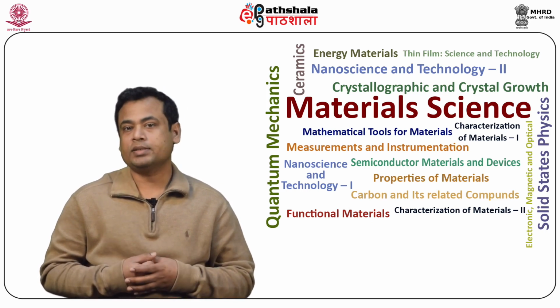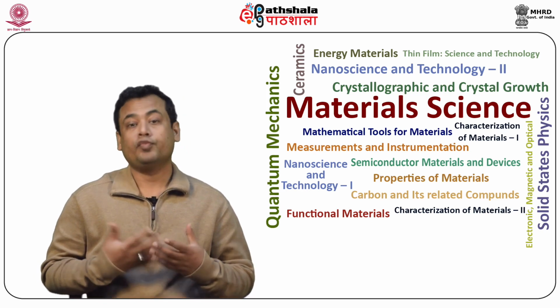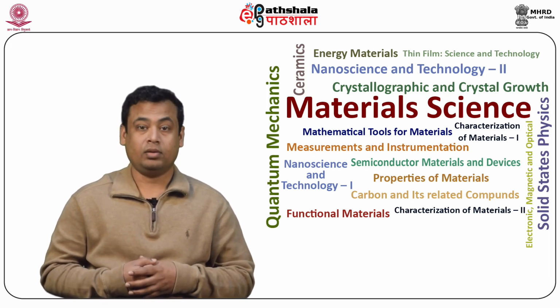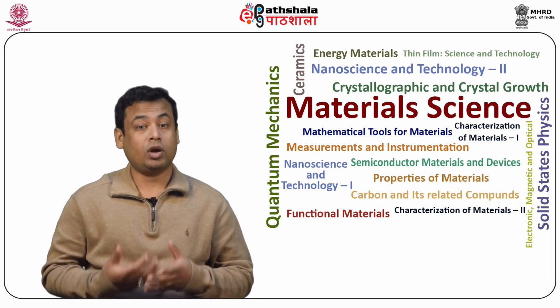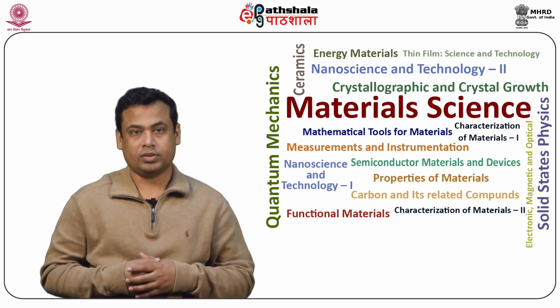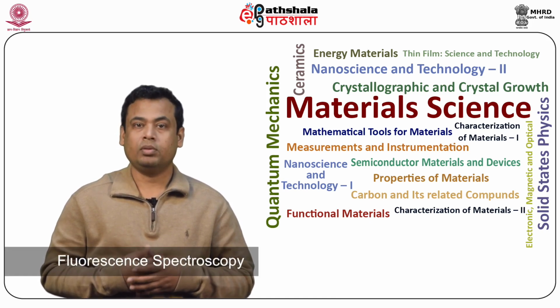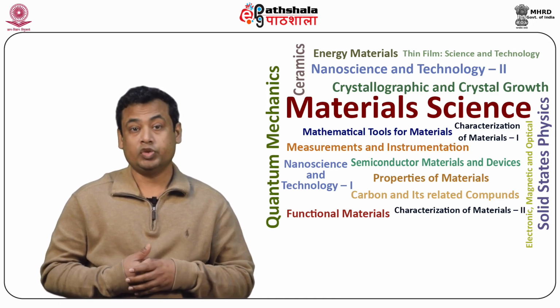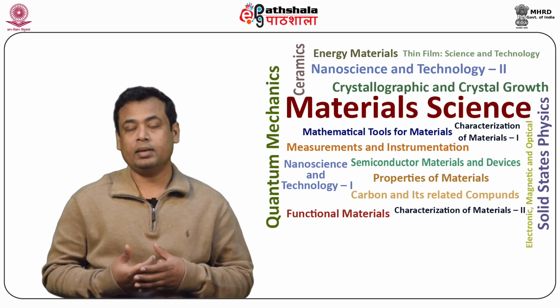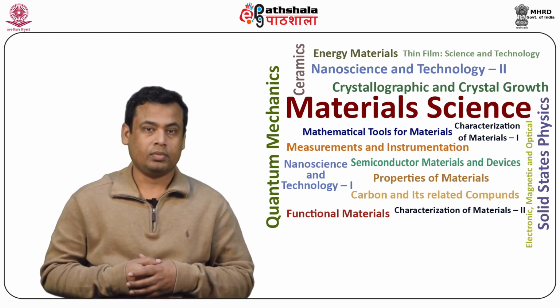Fluorescence signals are usually low intensity, and photomultiplier tubes and diode array detectors are the commonly used detectors. Fluorescence spectroscopy measures optical signals using two types of detectors, single and multiple channel detectors.